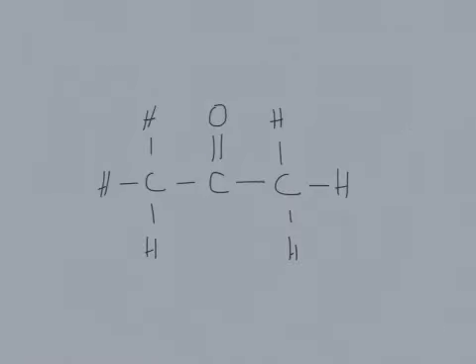Another point in the proton NMR that we can do to check ourselves in order to be 100% sure that we do have the correct structure is to do the spin-spin coupling, the N+1 rule for the number of peaks. So like we were saying earlier, these three protons are symmetrical to these three, meaning that we are only going to have one peak.